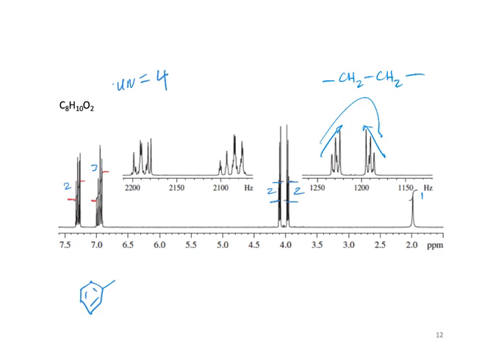Okay, so we have 2 CH2s. They almost have the same chemical shift. We have 2 oxygens, so it's likely between 2 oxygens. Ether to an alcohol? Right. So I think it's an ether, CH2, CH2, to an alcohol on the end.